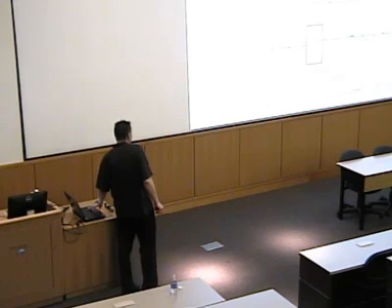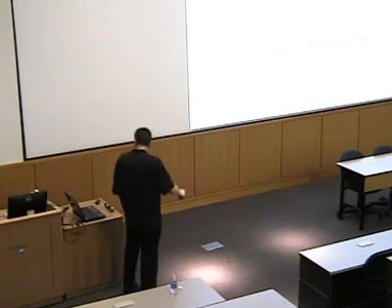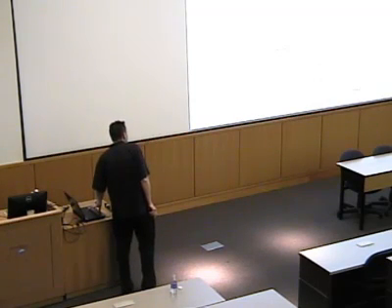So now let's fast forward. So we looked at wild type and a couple of the mutants. Here's just an example of the wild type. So you can see it's a mixture of high spin and low spin, but here's our big charge transfer band. And then we can jump over this.